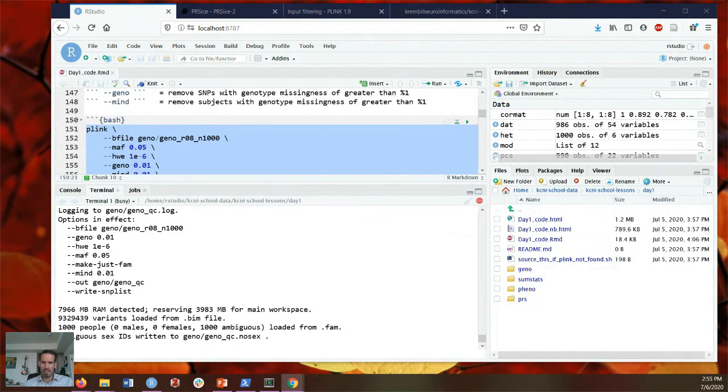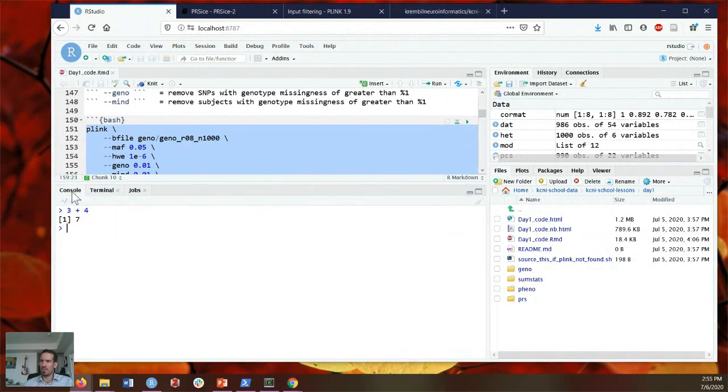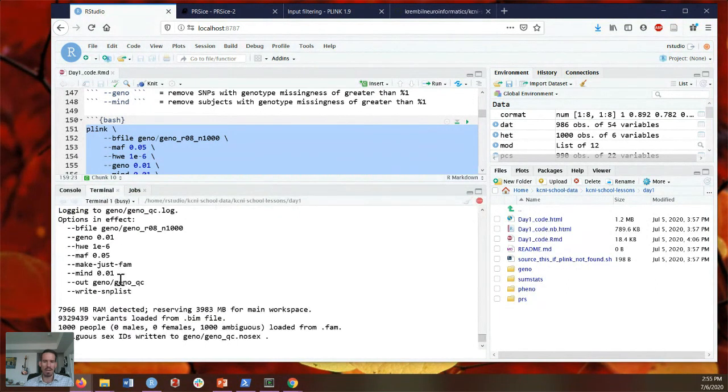Copy, so instead of clicking the run chunk inside of our markdown, when I click the run chunk, it sticks it into the R console instead of into terminal. And I don't know how to get it to directly paste the chunk into terminal rather than into R console. So if you have a fix on the way to do that, that would be very much appreciated.